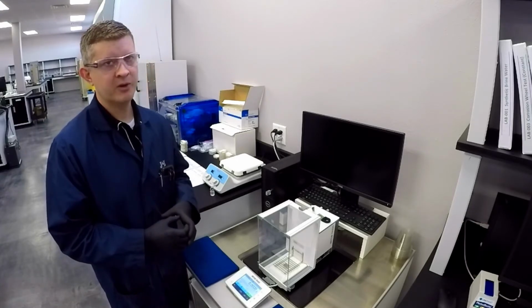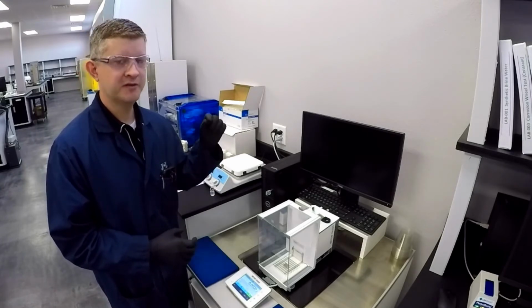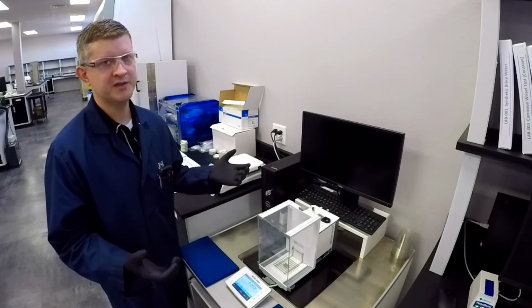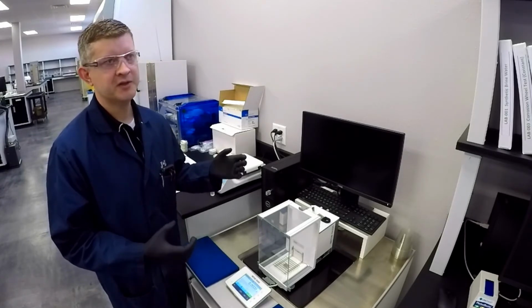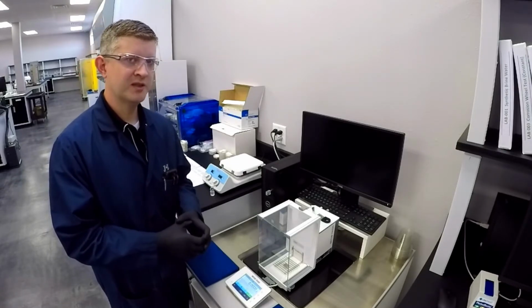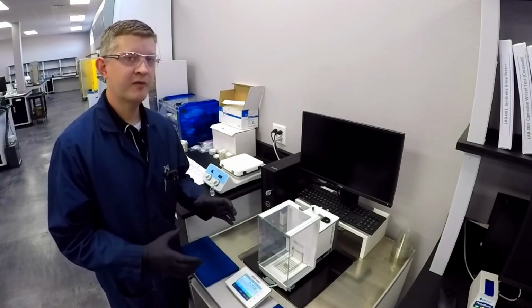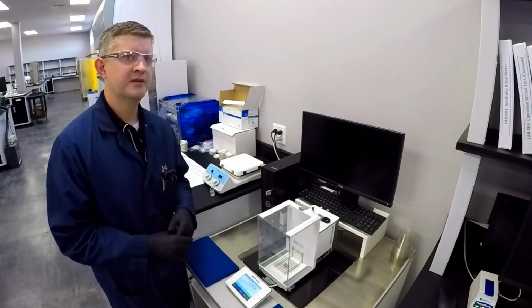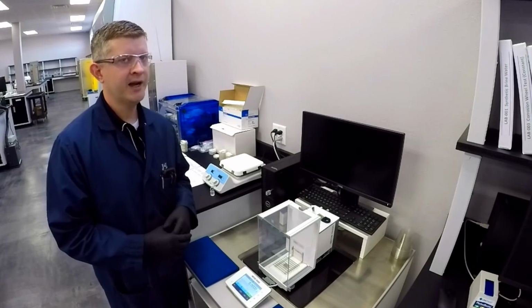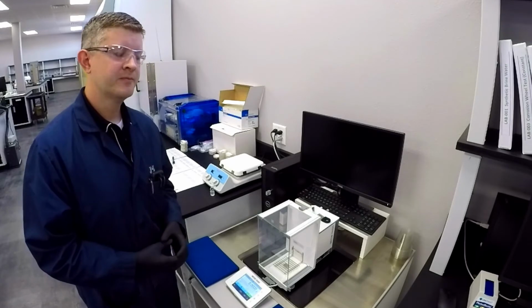Whenever you're looking at Millipores, they're capturing suspended solids. Oil is not technically a suspended solid, it's a liquid. So a lot of the oil is going to pass through the Millipore. There will be some that's absorbed onto the Millipore and does not make it through. Those components, along with any suspended paraffin, are going to be removed by the xylene step. But typically, your oil carryovers are going to be higher than what you see for your percent hydrocarbons on your Millipore filter. Oh, okay. That makes sense.